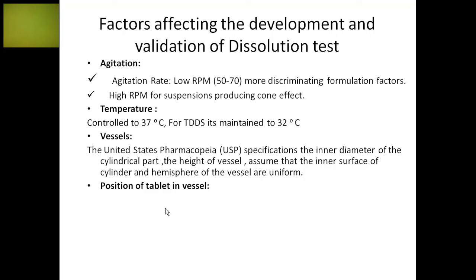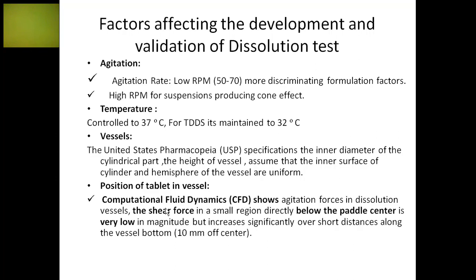As per studies by computational fluid dynamics, the agitation forces in the dissolution vessel show that the shear force is low in a small region directly below the paddle, at the paddle center. It is found to increase significantly if you move at least 10 millimeter from that point. So if the tablet is kept at least 10 millimeter away from the central bottom of the paddle, it is capable of producing better dissolution.